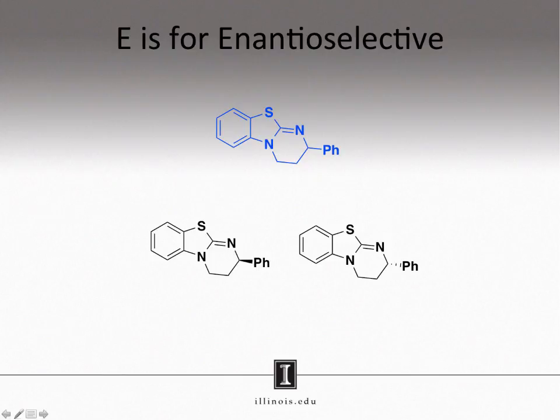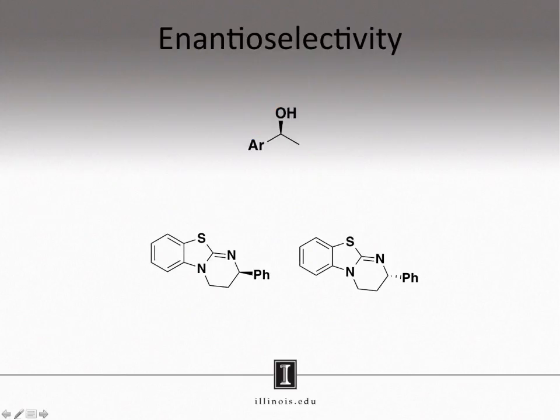Okay, so HBTM is chiral. Why do we care? We care because while enantiomers have the same physical properties, they may and often do have different chemical properties. In this experiment, you will take each enantiomer of HBTM and react it with one enantiomer of alcohol. In this case, let us assume that your unknown alcohol possesses this stereochemistry.